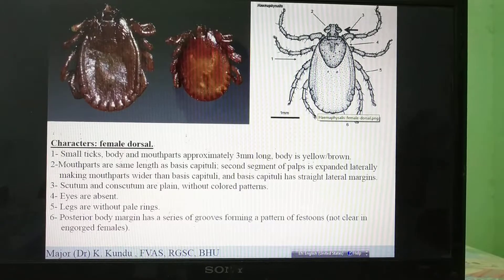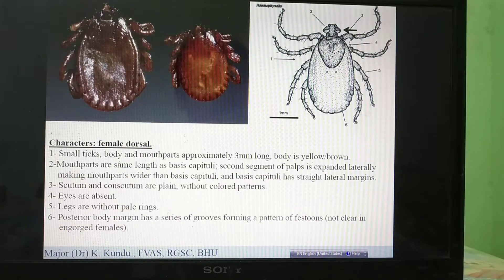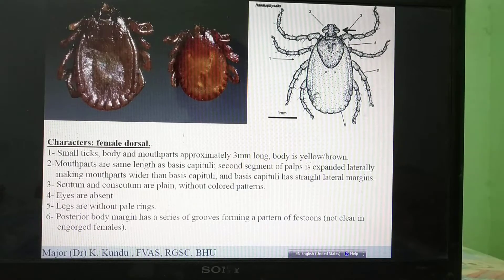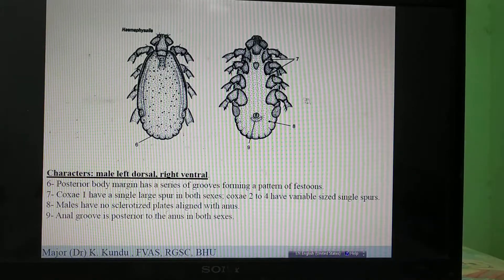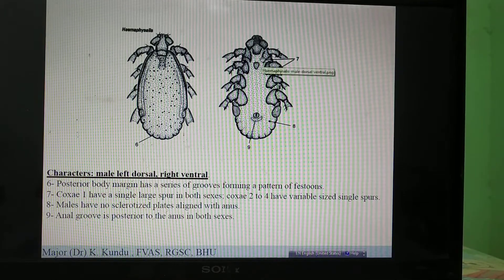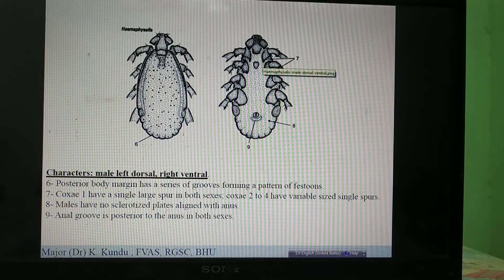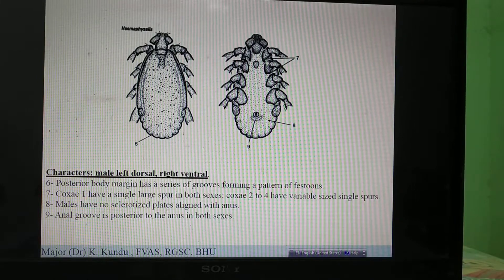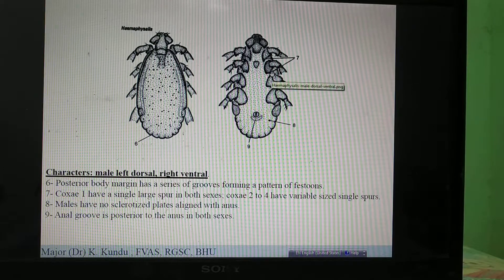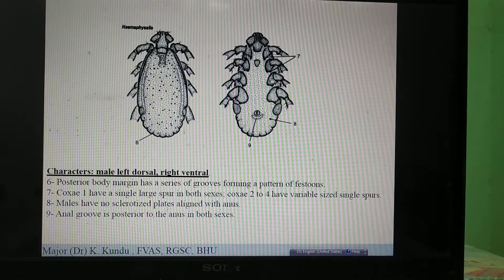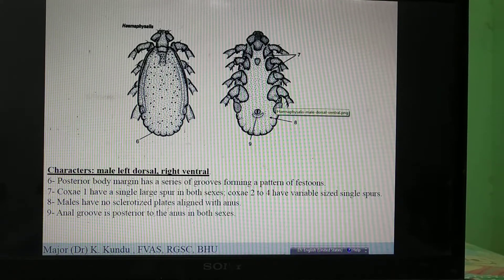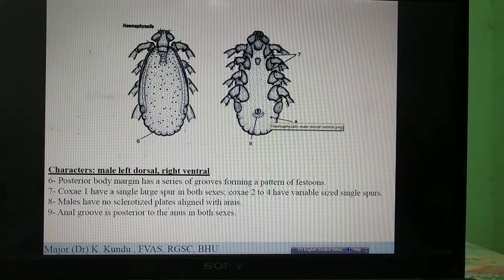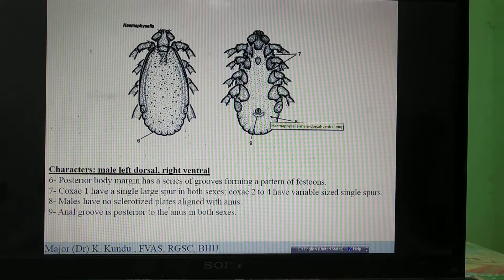Eyes are absent in Haemophysalis. On the ventral aspect, there are spurs on the first coxa, second coxa, and fourth coxa. The first coxa has a strong spur as in Amblyomma, the second coxa also has a spur, and the second and fourth coxae have spurs of variable sizes. There is a posterior anal groove and no plates in Haemophysalis.